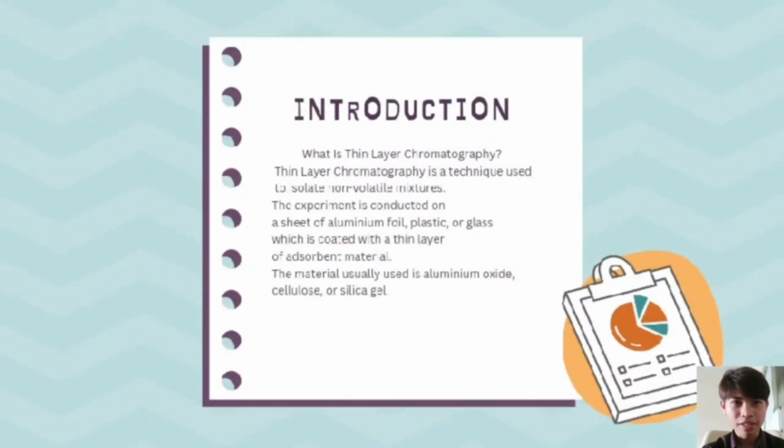My name is David Gilbert and my student ID is 2021 12 50 47, and I'm going to begin with the introduction of TLC. What is TLC? TLC is thin layer chromatography. Thin layer chromatography is a technique used to isolate non-volatile mixtures.